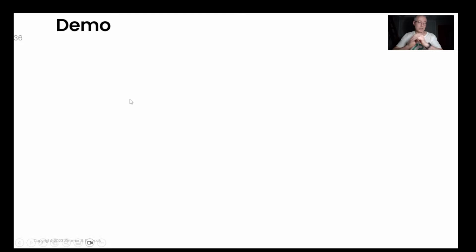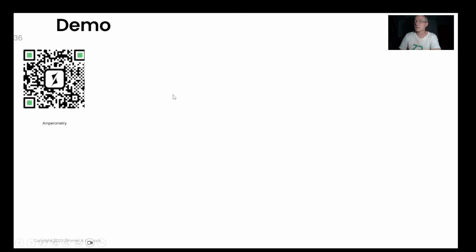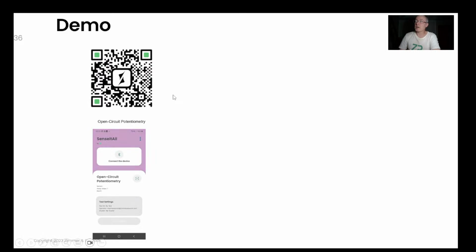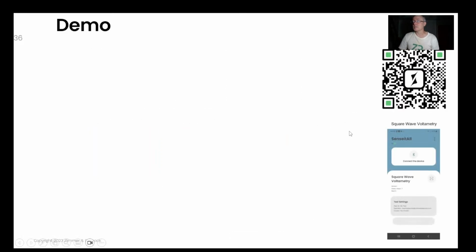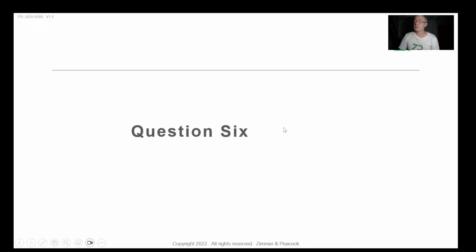So that was the demo. Theoretically, we could also do that for these organophosphates, and I think that particular compound is one of the targets that we could do. So it's a pretty powerful technique. Any of these techniques can be used in conjunction with that data pipe to essentially translate the assay out of the lab and onto the market, or at least into the hands of real users.